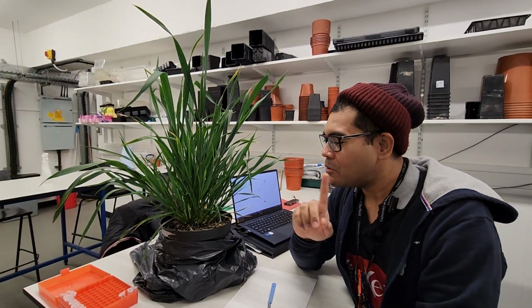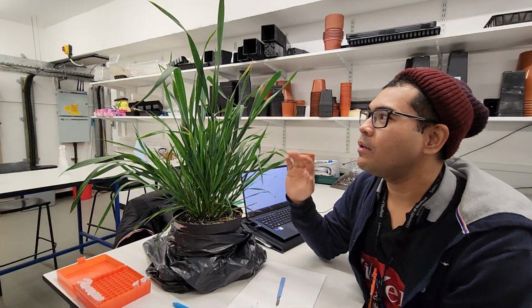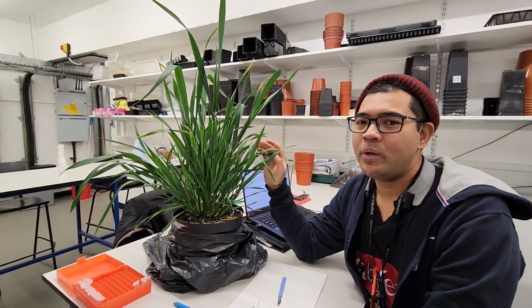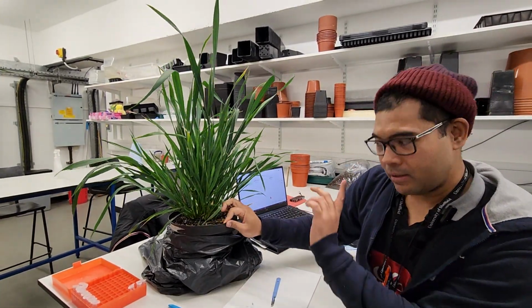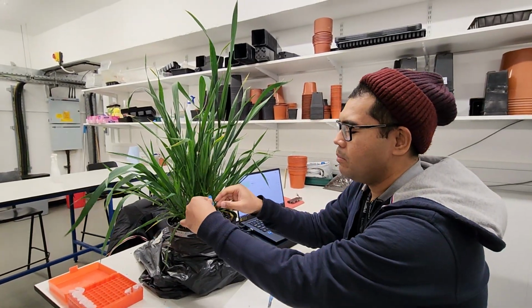So let's do some sample preparation using, what plant is this? Wheat, Skyfall. But it's not a mutant, so do not worry. It's a wild type. I've got all the label here.